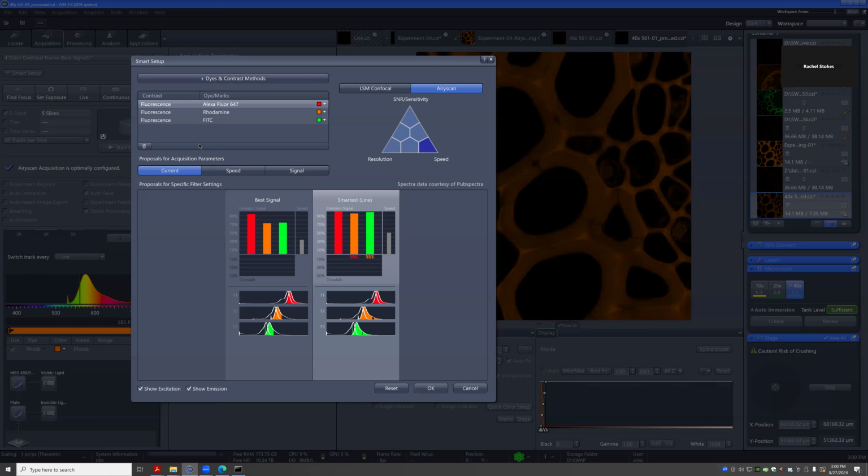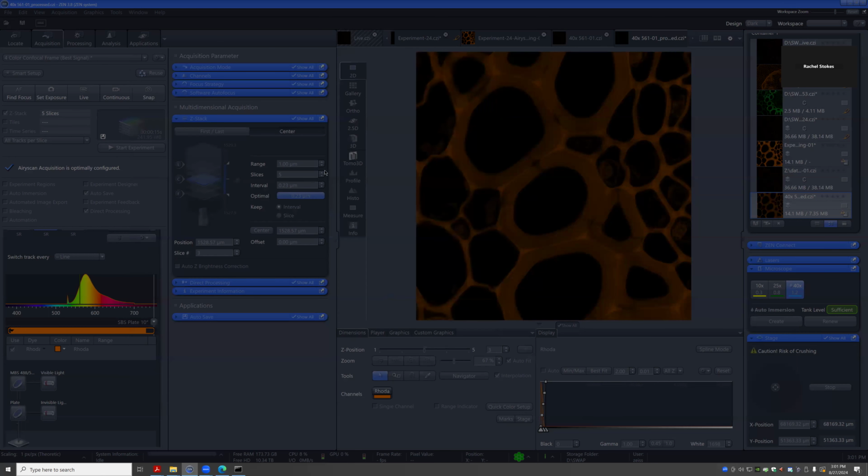I just don't know, like, in the experiment, a fluorescent signal will show up at 2 hours, and after maybe 4 hours the other signal goes up or something. So that's why you report the time points. Yeah, exactly. 4 hours.